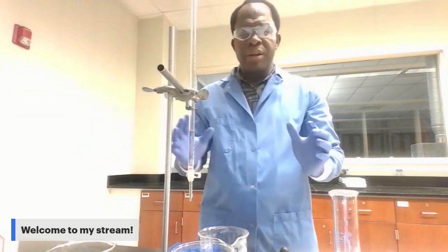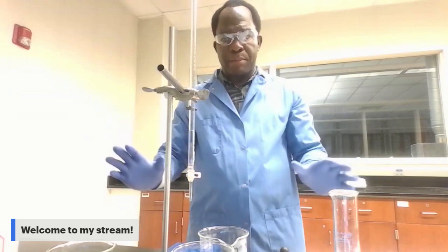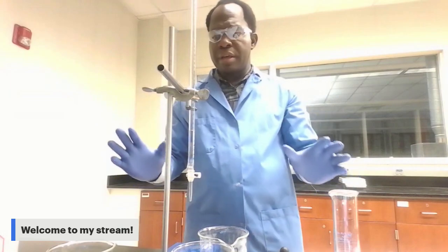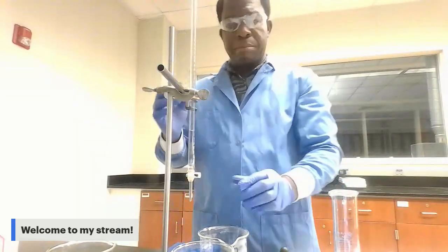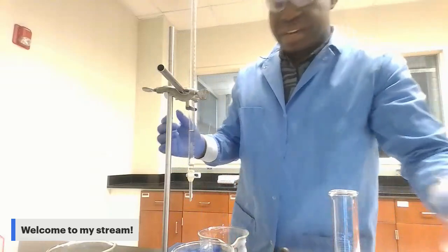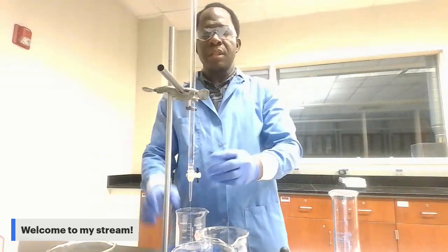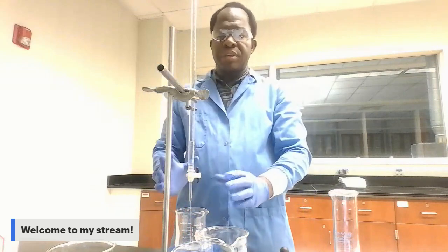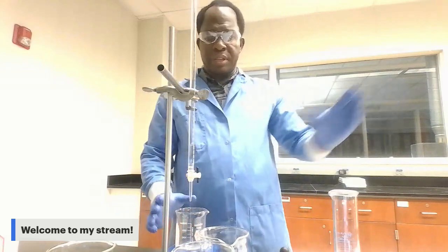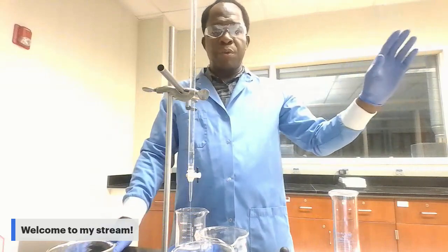So now when you're done, you have to clean up. Make sure your desk is clean. Clean up here means dump. You have to drain the rest of the HCl out of the burette, and then you dispose of this inside the liquid waste.